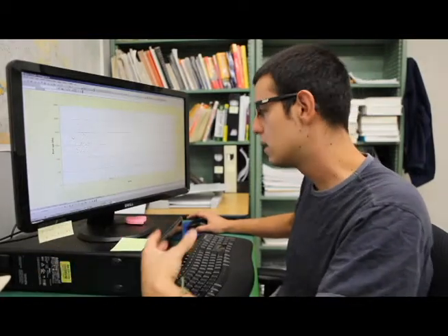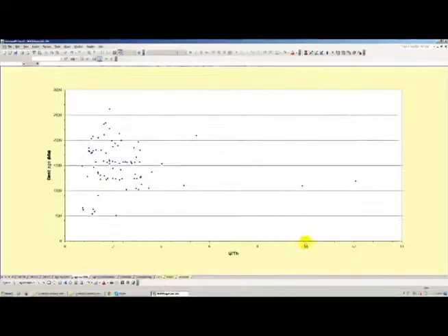For the most part, people agree that values that are significantly higher than 10 in uranium-thorium ratio, or lower than 0.1 if you're looking at SHRIMP analysis, because you're looking at thorium-uranium ratios, those grains are commonly considered as being metamorphic in origin. But in this case, all the grains cluster at really low uranium-thorium ratios, meaning that they have high thorium contents and are likely of igneous origin.